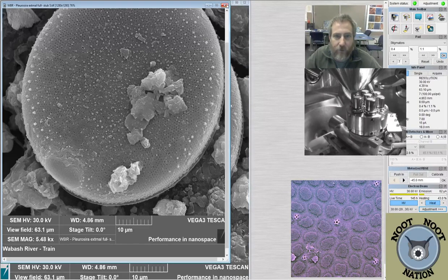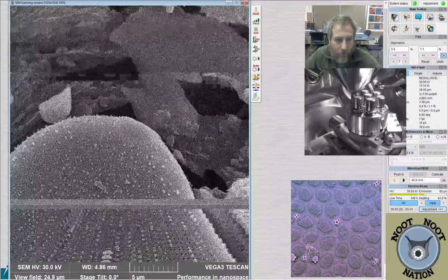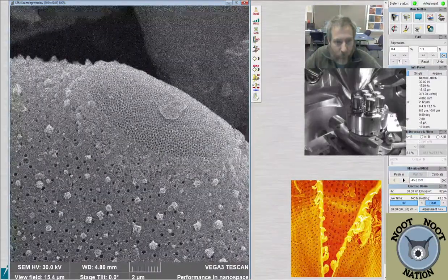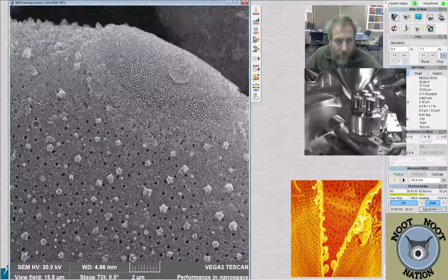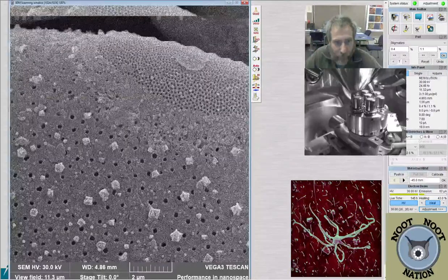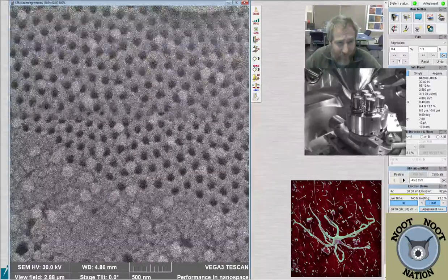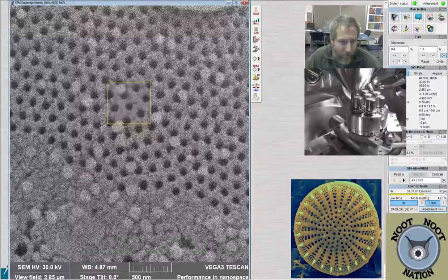And I'm going to just zoom in now on one of these little ocelli so we can get a sense of the differences between the main body of the diatom cell wall, which is here on the surface, and these ocelli, which are basically the little tiny pore fields that are here. And as I mentioned, they usually squeeze a little jelly-like substance out through the holes to tie to a neighboring valve.